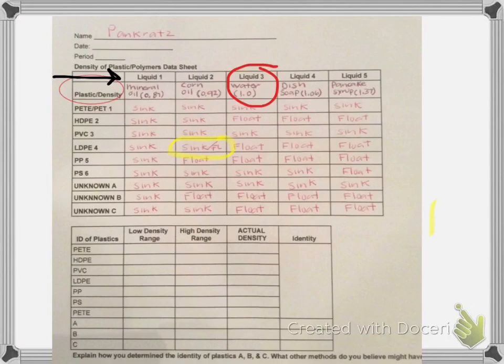For unknown B, I see that it has 1 sink and 4 floats, and another one of my known ones also had 1 sink and 4 floats, so I see that polypropylene is possibly one of them. And then for unknown C, I see 2 sinks and 3 floats, and if I look over there, I also get possibly HDPE or LDPE. So when we do our low density and our high density trends, that's where we're going to be able to see some of these trends.